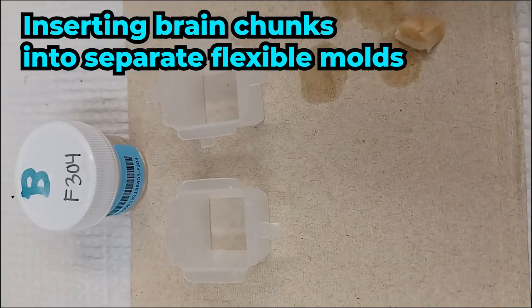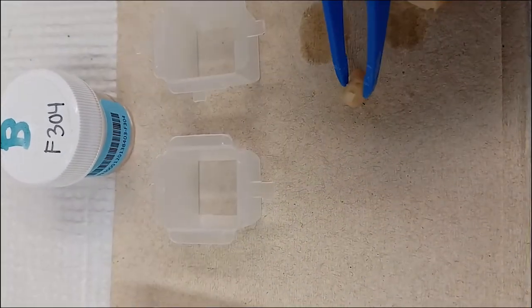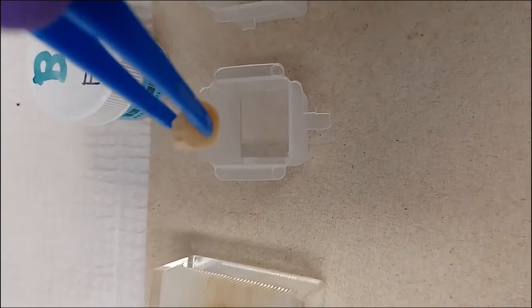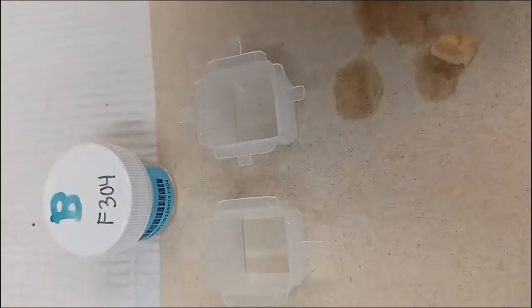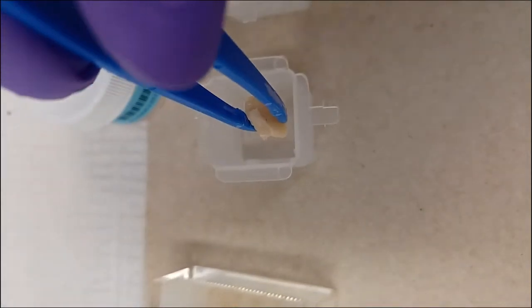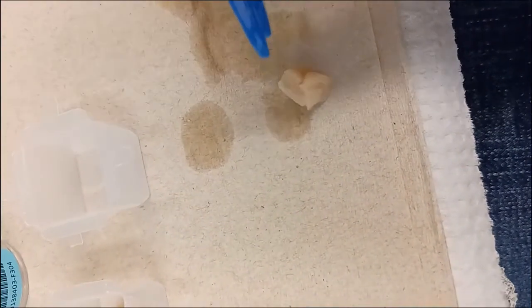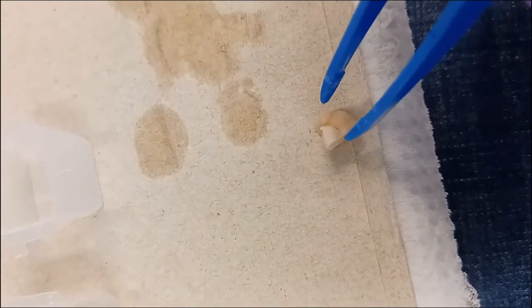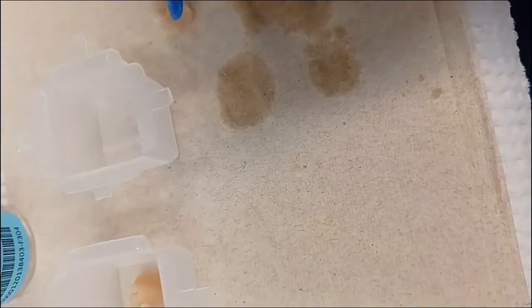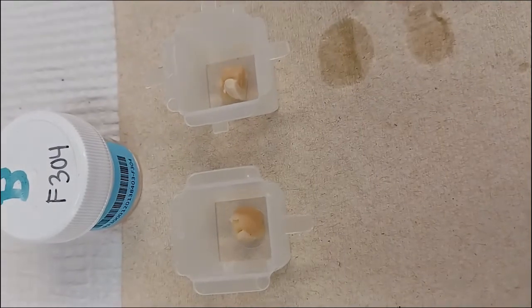When preparing our brain chunks to be immersed in agarose, we want the flat side down — not on the hemisected side — so the tips are facing up. The very frontal tip of the brain should face upward. We'll dab it on a paper towel to make sure it's just dry, then carefully lower it into the center of this flexible mold. We'll do the same thing with the back half of the same hemisphere, briefly dry it off, and lower it into the center.